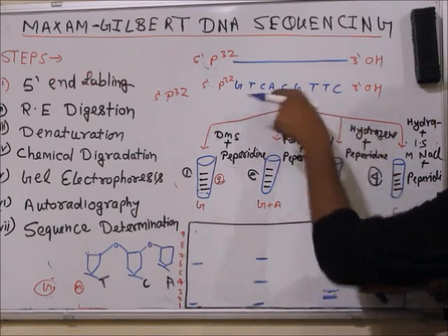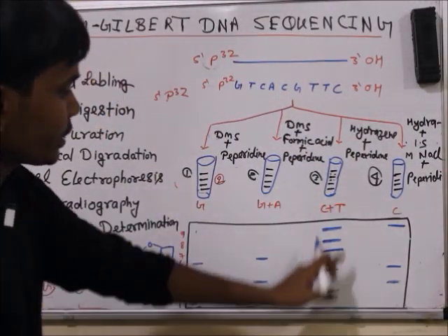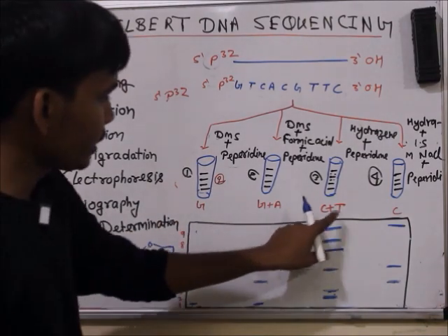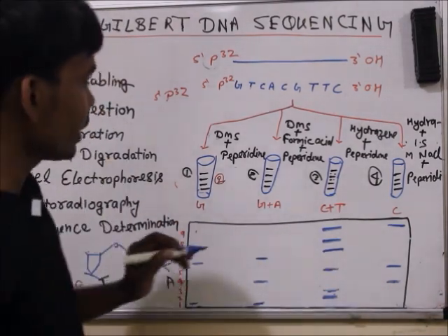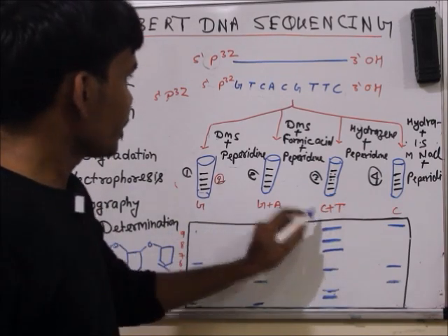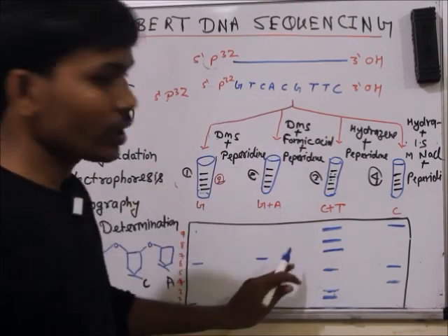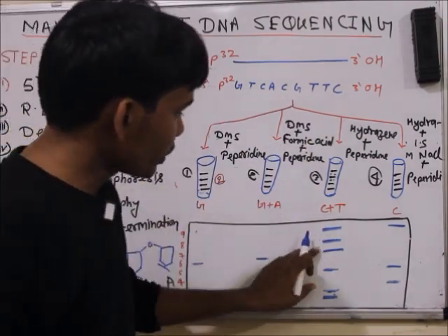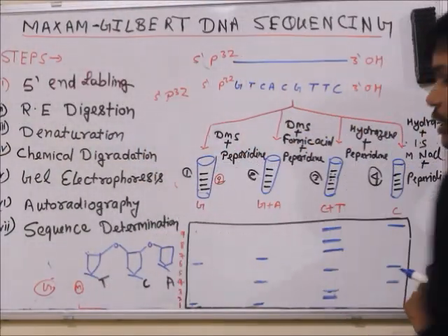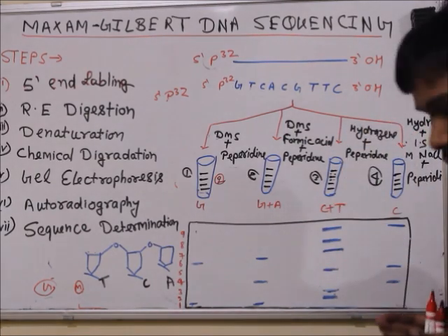So these are the sequences in the gel of both cytidine and thymine. Count that. What is the cytosine number? Cytosine, thymine: that is 3 cytosines, 1, 2, 3, and 3 thymines, 1, 2, 3. So the number of bands would be 3 plus 3, that is 6. Combining these, 6 bands would be obtained. So this was the combination of cytidine and thymidine.